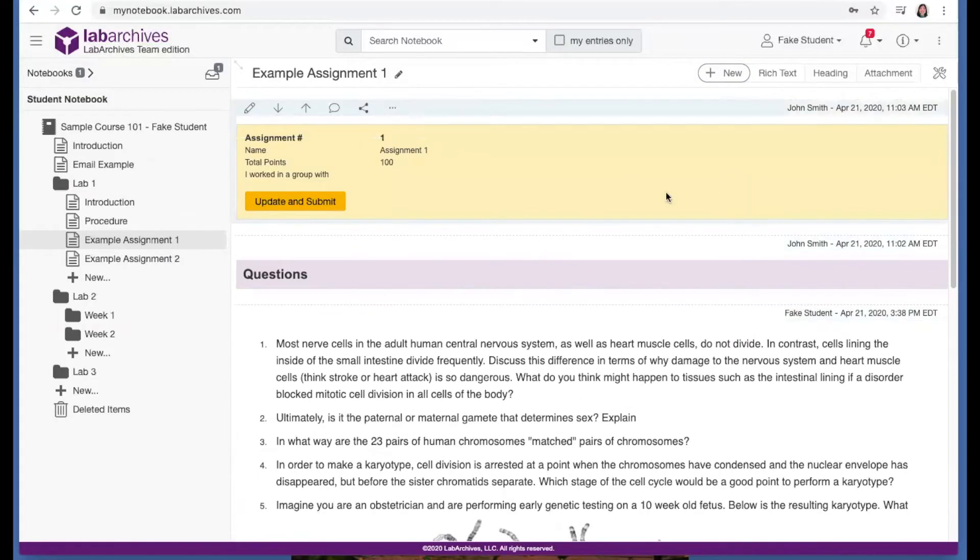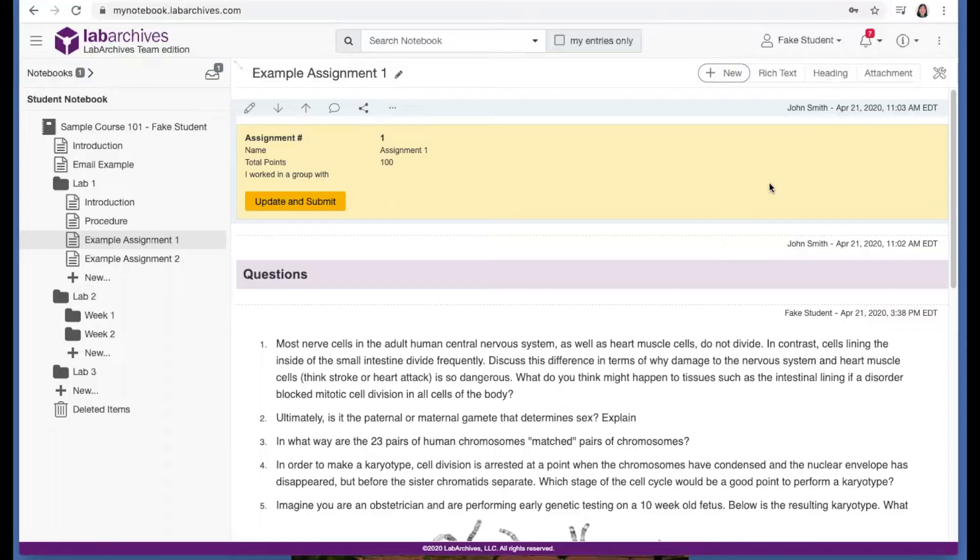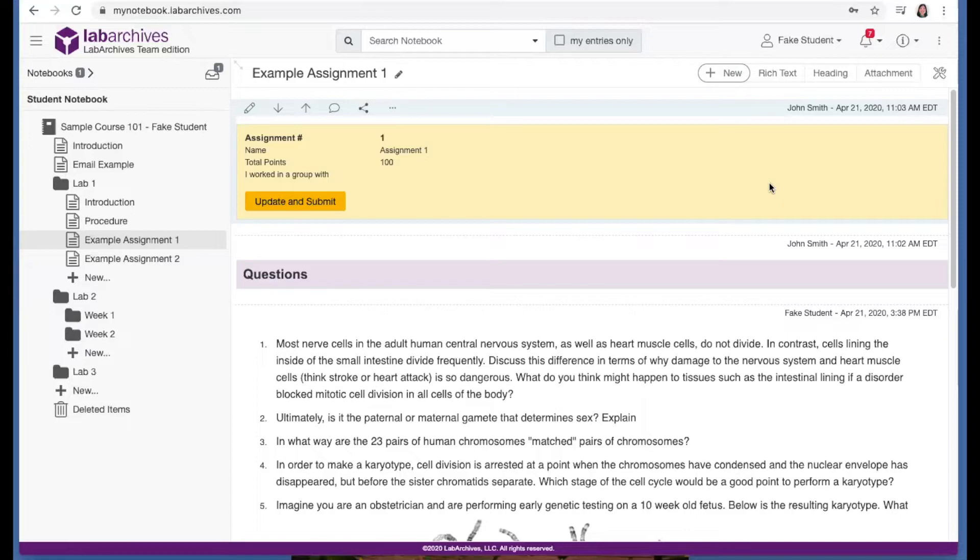This yellow box right here is an assignment entry. Most instructors add an assignment entry to pages that need to be submitted for grading. As a student, the assignment entry is very important. An assignment entry indicates that on this page, you'll need to either answer questions, add data, or follow instructions given by your instructor, and then submit.